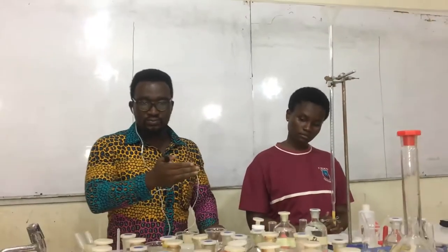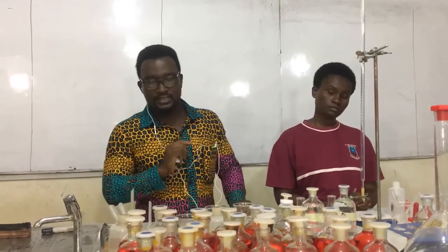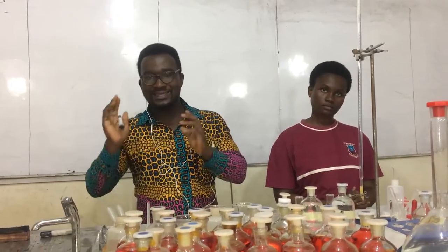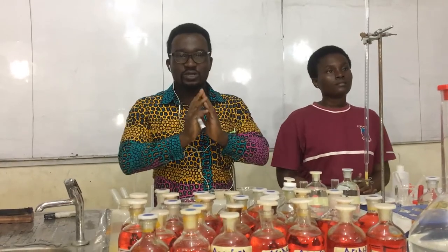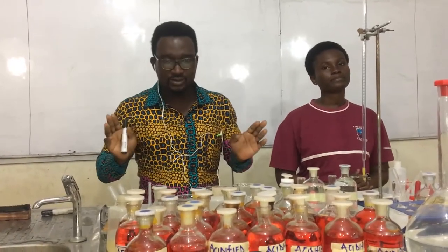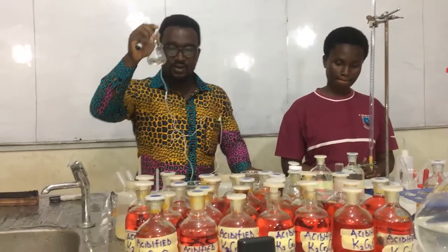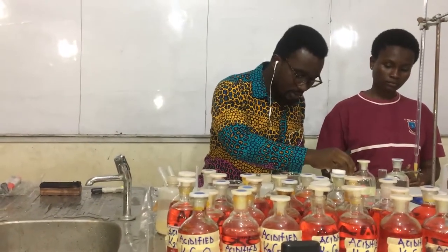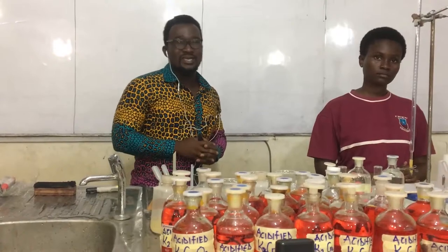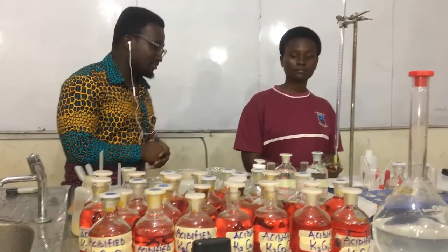If your guess is that it will increase the volume of the amount which has already been pipetted, then you are correct, which will also interfere with the titre volume. Therefore, it is unnecessary and not advisable to rinse the Erlenmeyer flask with solution B before you start the titration. Our madam will begin the action. Madam, it's up to you.